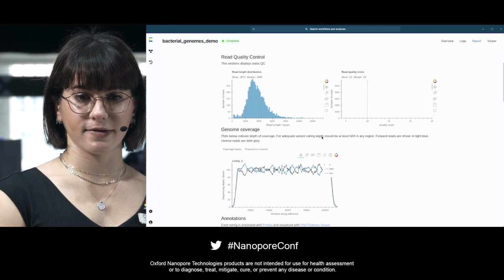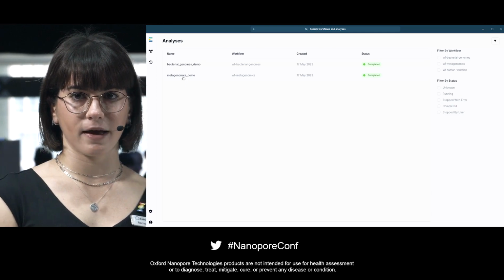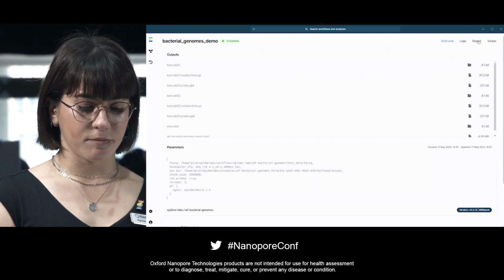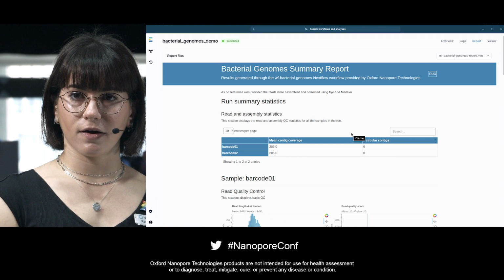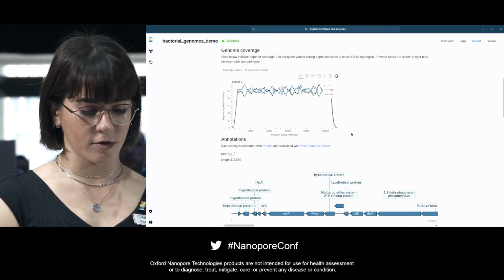With the data gathered from nanopore sequencing, you have excellent input to bioinformatics tools to help solve these challenges of the unknown. We have EPI2ME solutions, and they were just announced yesterday. We now have an automated de novo assembly of bacterial genomes, and an in-depth metagenomic analysis as well. The bacterial genomes workflow, as you can see on the screen, provides assembly, variant calling, and annotation in a really nice report and easy-to-use format.